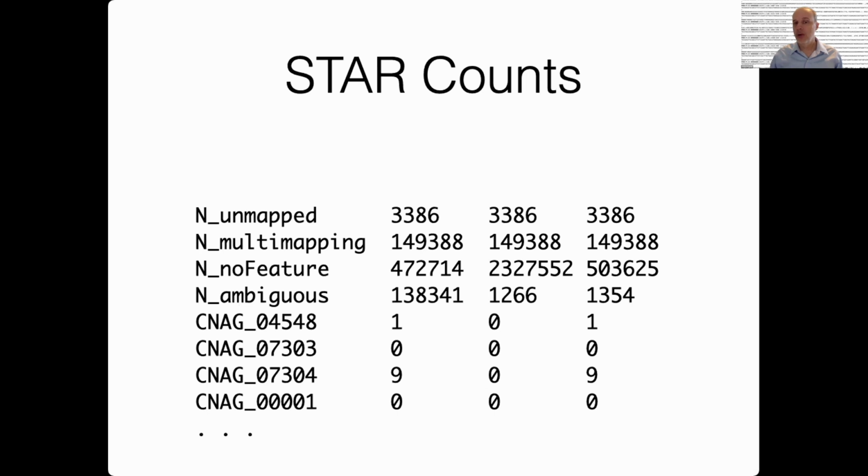So for normal protein coding genes, you expect it to come from one strand of the genome and not the other. If you've prepared the library in a way that you can, it's called a strand-specific library, you can then look and say, okay, are these reads actually mapping to the strand that I expect?